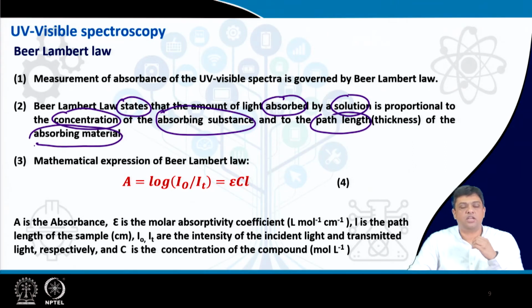I have encircled few terms which are critical. What is the Beer-Lambert law actually indicating towards? That light will be absorbed. This is one.